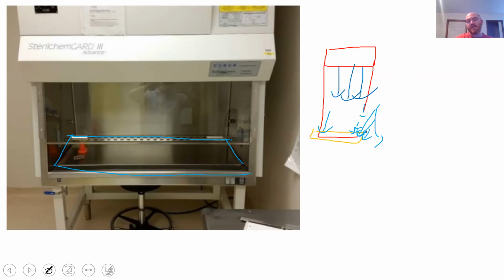So these are the isolation hoods. You can see that there's a glass sheet there. And one important thing to remember if you're going from the chemo hood to a positive hood is you lose your glass sheet. Whenever I would do hazardous compounding, a lot of times I would actually rest my head against the glass because it was just more comfortable. And then you can bring your items really close to you because it's behind the glass, but you cannot do that in a laminar flow hood. So just remember whenever you're switching environments.